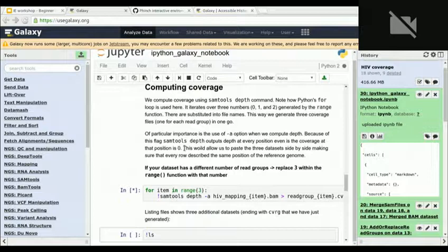Question? Oh, I'm sorry. So, you had mentioned earlier, you had just done the -y regardless. If you had forgotten to do that, or maybe it was a tool you're unfamiliar with, are you able to interact and say yes or no, or is it essentially going to freeze at that point because you're not able to get the input? Well, my experience is it's not going to do anything, so you have to restart your kernel. I don't know if there's a solution. It requires your input. But me doing that might represent the fact that I don't know how to do it.